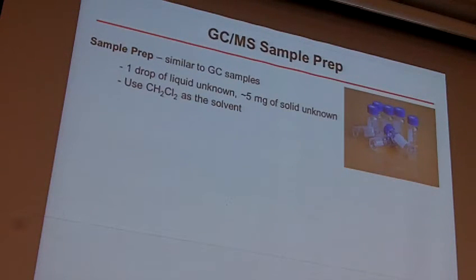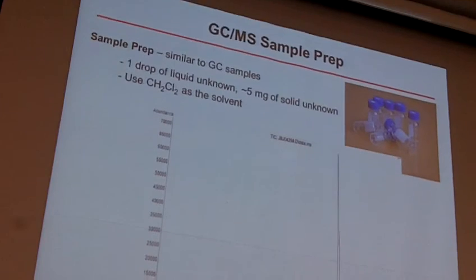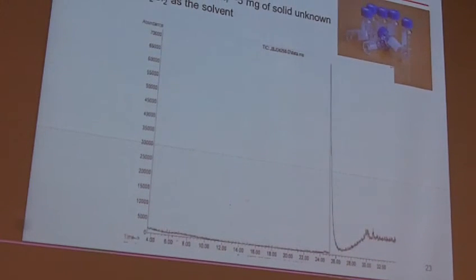up with a couple of pieces of data. The data that comes out, one, you're going to get the GC. This is just an example of a GC. You'll note here that there's one super major product present. Nothing else is there. This GC is exactly the same as what you saw before in last semester. One thing I'll note is you really can't get a lot of information in terms of identity from the GC alone. What this basically tells you is there's one species present, and that's it.